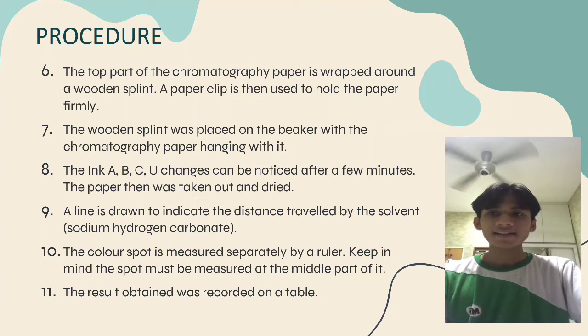Next, a line is drawn to indicate the distance travelled by the solvent. Next, the color spots are measured separately using a ruler. Keep in mind that the spot must be measured at the middle part of it. Last step, the results obtained were calculated and recorded in a table.